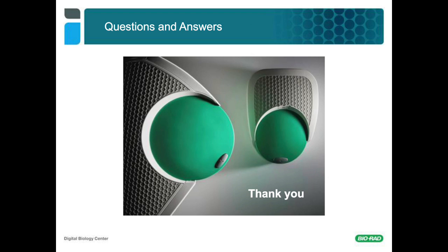The other thing to keep in mind is Droplet Digital PCR droplets are made in a cartridge that has microfluidics. Microfluidics don't like it when small fragments of schmutz, small pieces of plastic, or beads, if you use beads in your cleanup methodology, are present. Those small pieces of solid material will then plug your microfluidics channel. So that's something to keep in mind. All of the methods so far work fairly well as long as care is taken in the actual process.